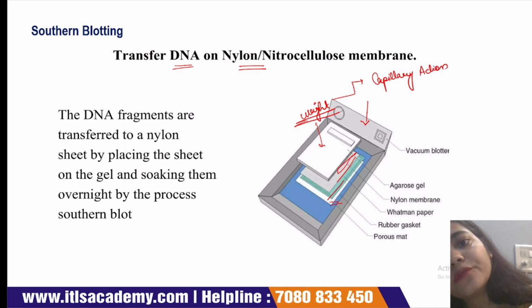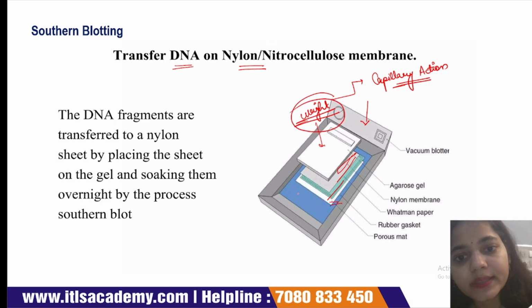The transfer of the DNA sample from the gel to the nylon sheet is due to capillary action. Due to this weight and this buffer, the capillary action will perform easily.